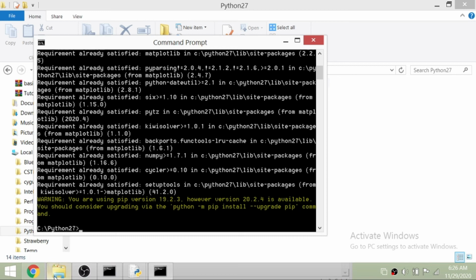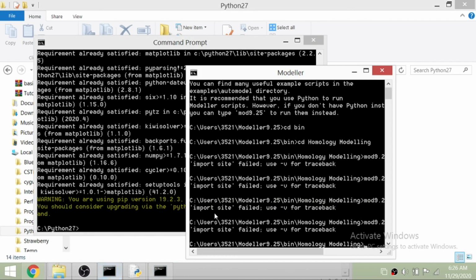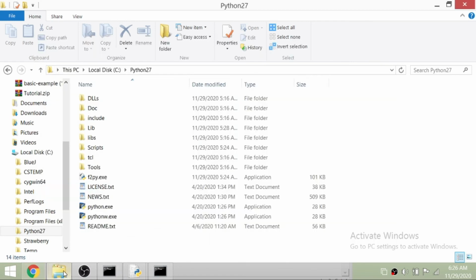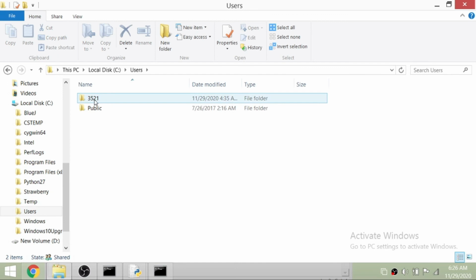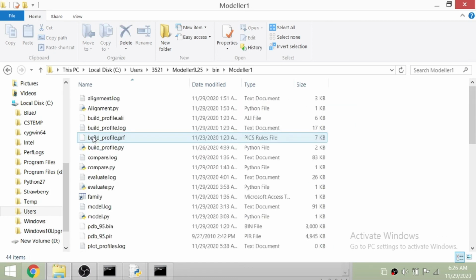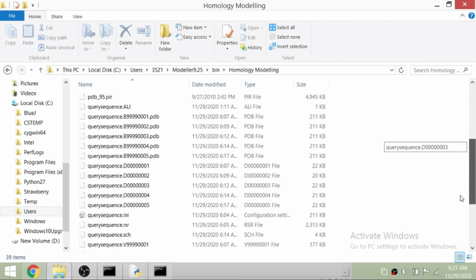After installing these two, what you need to do is run the plot and find out how the model is actually predicting your structure. Now it's done. Now let's go to the folder where the things are installed, model bin. The evaluation is done, and now I want to generate the plot, right?